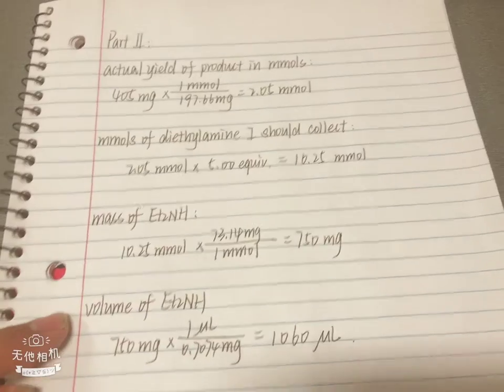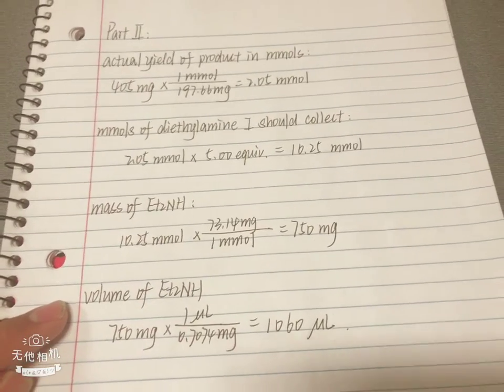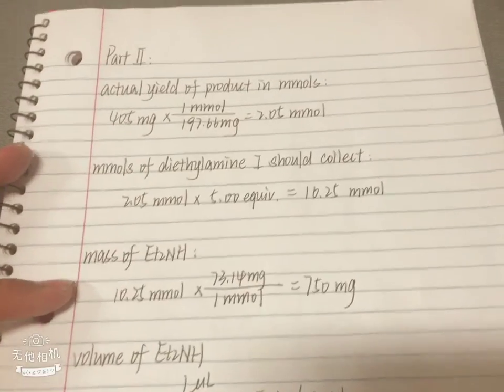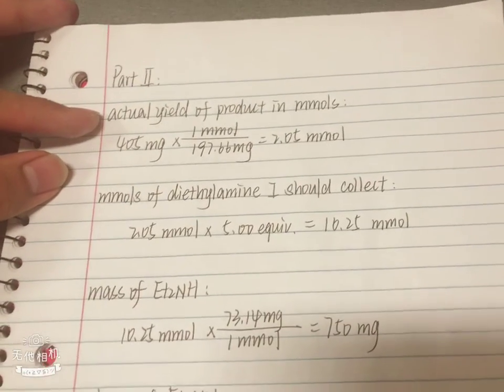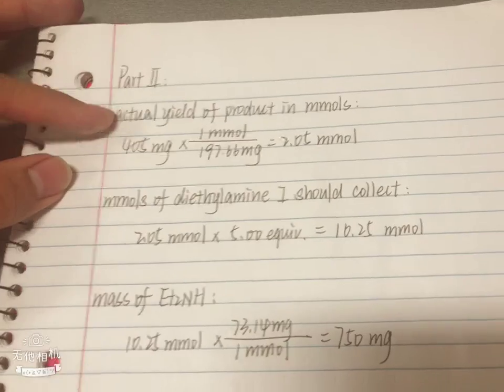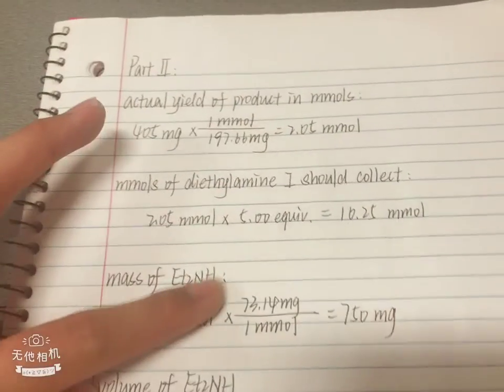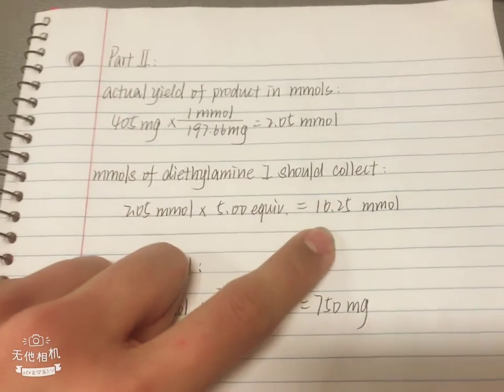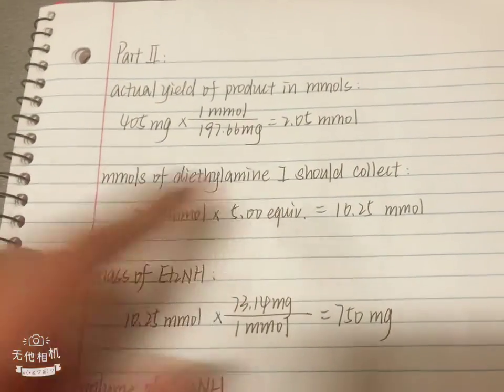Then in part 2, we need to first calculate and measure 5.00 molar equivalents of diethylamine. In other words, I should collect diethylamine in the ratio of 5:1 to the product I got in part 1. Here's the calculation, and I would like to show you the volume of diethylamine I should collect step by step. First of all, we get an actual yield of the product in millimoles of 2.05, and we multiply it by 5 to get 10.25 millimoles. That was the millimoles of diethylamine we should get.